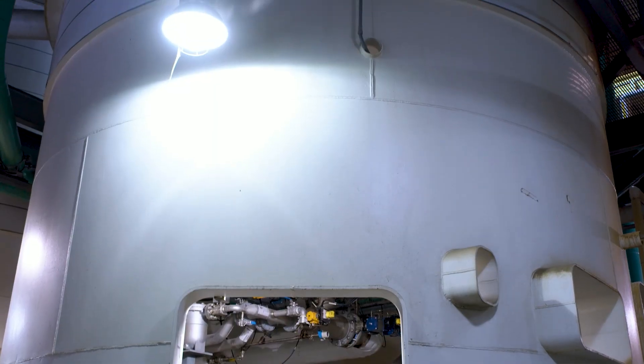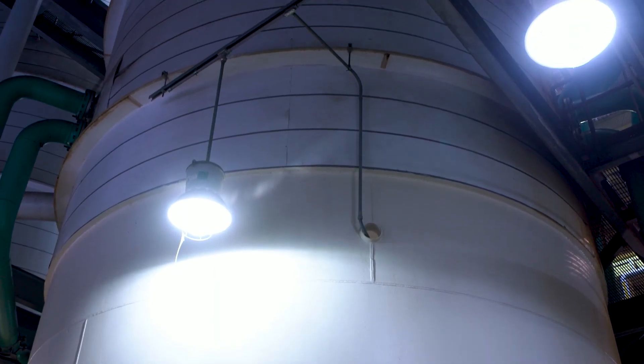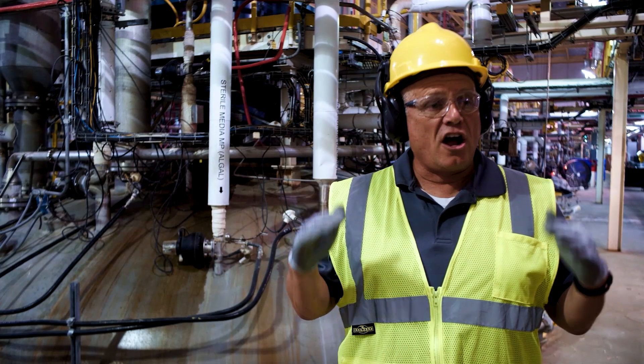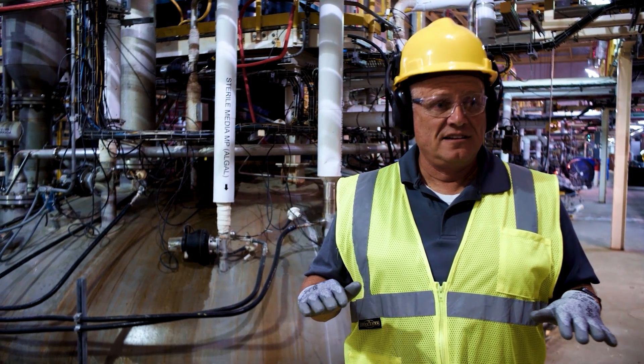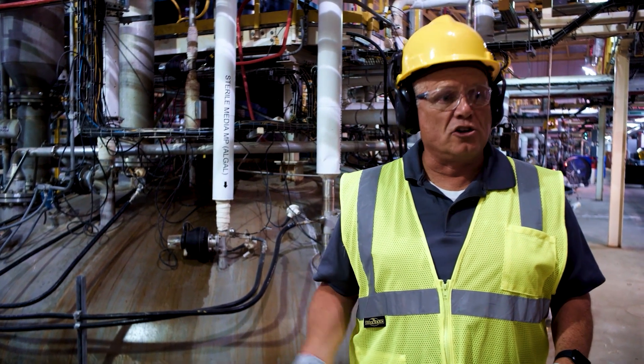This is the production fermenter. It is five stories tall. We will then stop cultivation, harvest the vessel over to downstream.